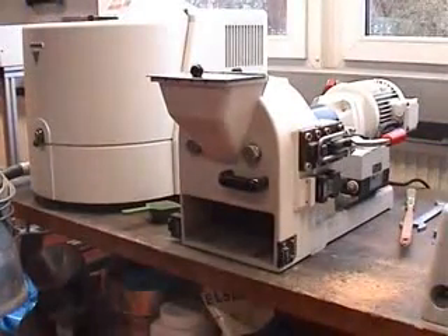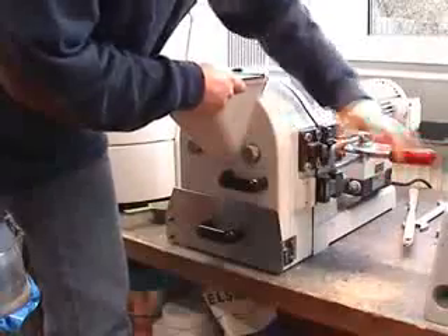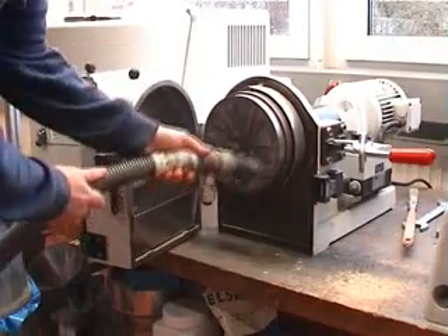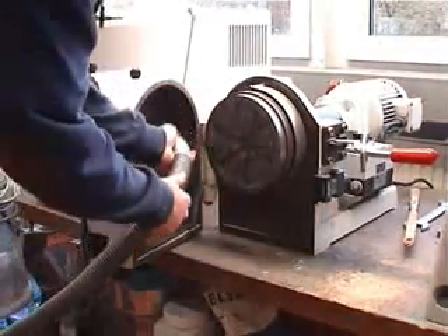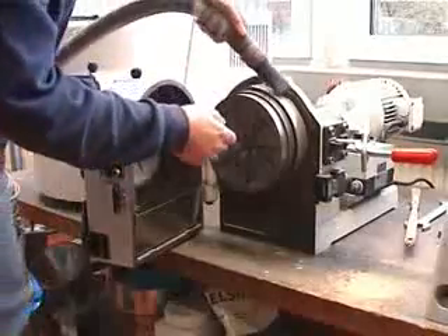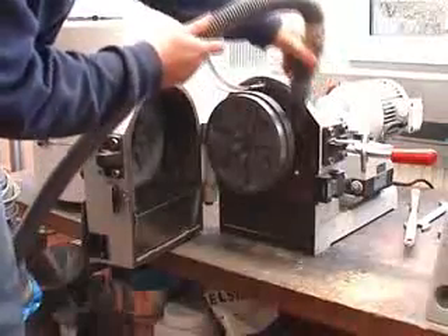Also, the way of cleaning the mill is very easy. You just open the mill again, and with a vacuum cleaner you clean the discs on this side or the other side. And by opening this panel here, you can also clean inside.